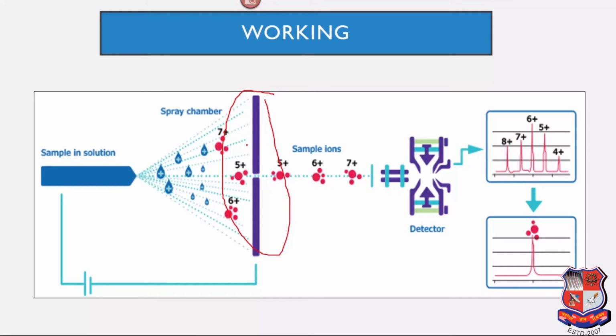So we have to ionize it there. The charges are created, and then the ions are differentiated. It creates some ions which form groups. Now in the detector, it is shown how many ions there are.